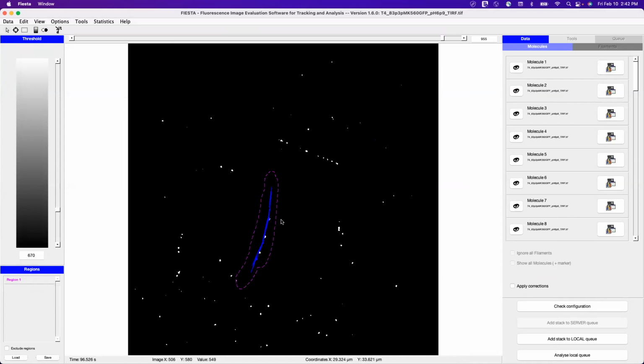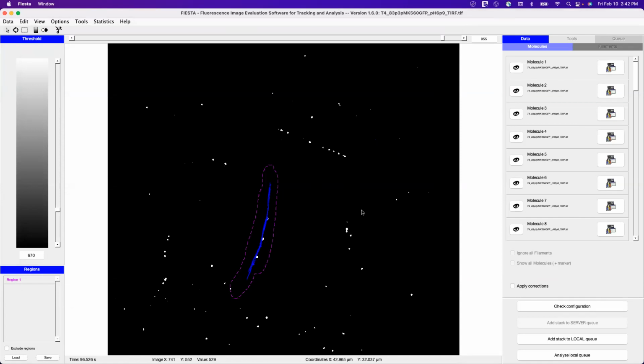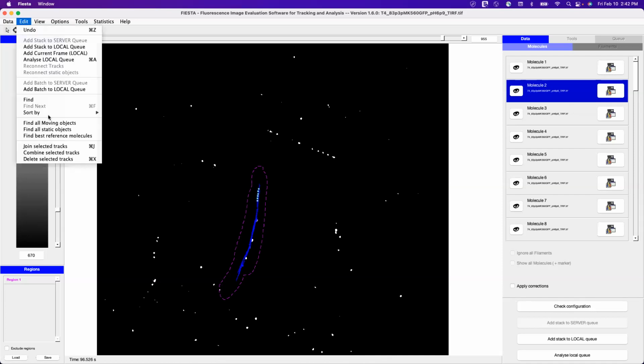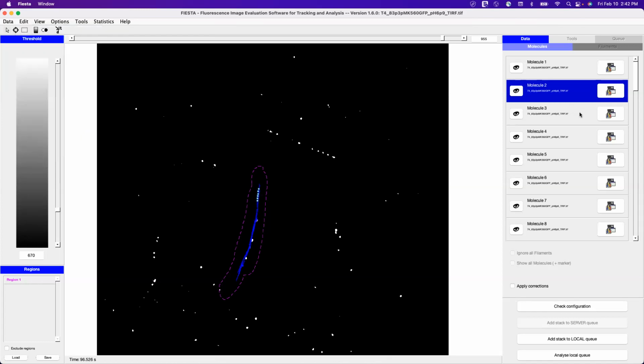So sometimes it can also split up. Sometimes it will get confused and basically make two traces for the same enzyme. Like it'll have half its run length in one trace, the other half in another one. If that does happen, you can just highlight those traces using this little tool up here, or select them on this list. You can then go to edit and combine selected traces. So let's just do it for two random ones. It's not going to look great, but you get the idea.